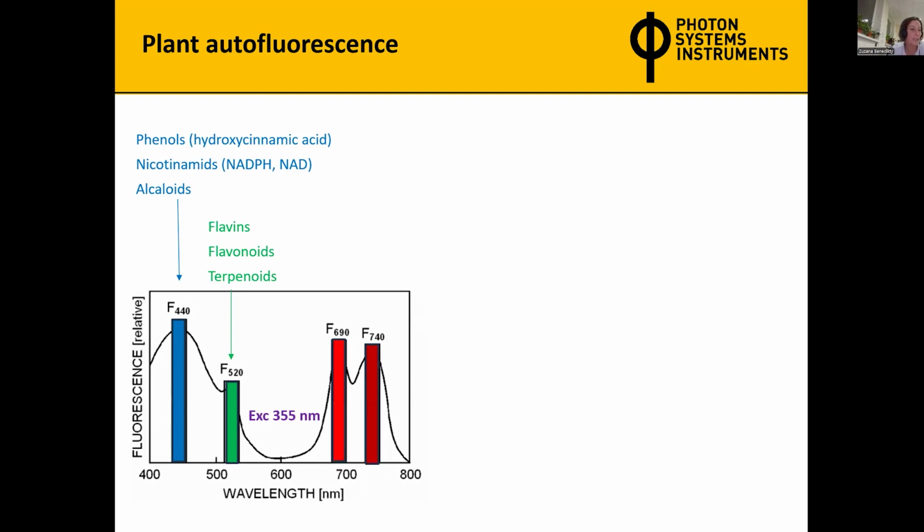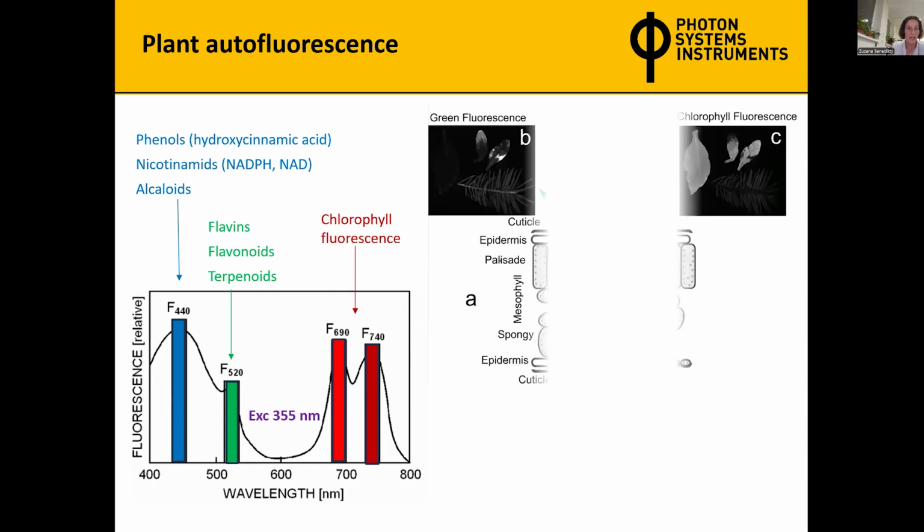And then we of course have red fluorescence, and this red fluorescence is a chlorophyll fluorescence. Again, you can measure two bands, or you can measure it more at 690, that is short wavelengths, that corresponds more to photosystem 2. Again, I will talk about that later. And you can also see the shoulder or the second peak more shifted to longer wavelengths at 730, 740. That belongs to photosystem 1. Here the peaks are very high. Normally they are not so high. Photosystem 1 is, or if you can see it, is less pronounced.